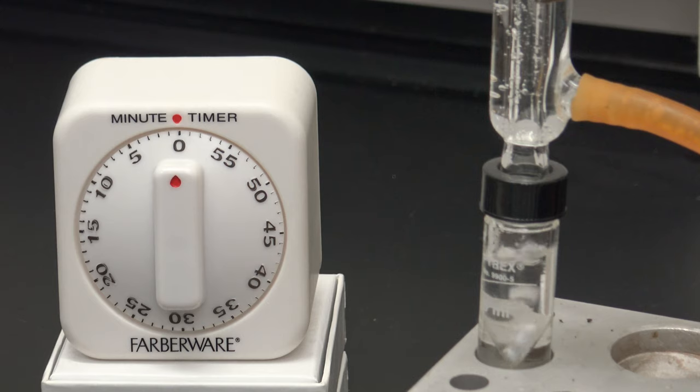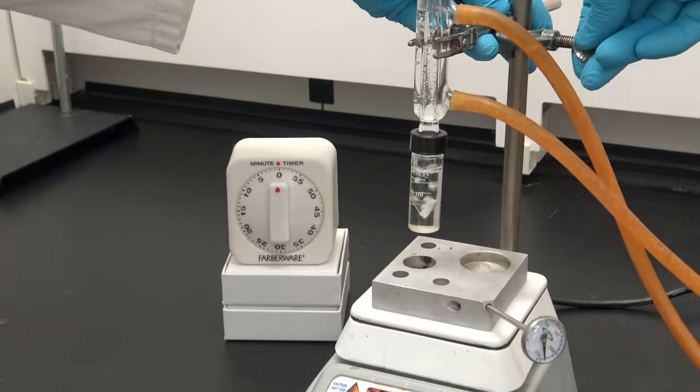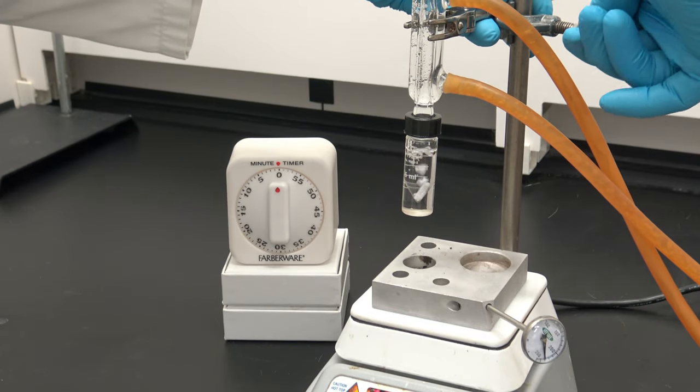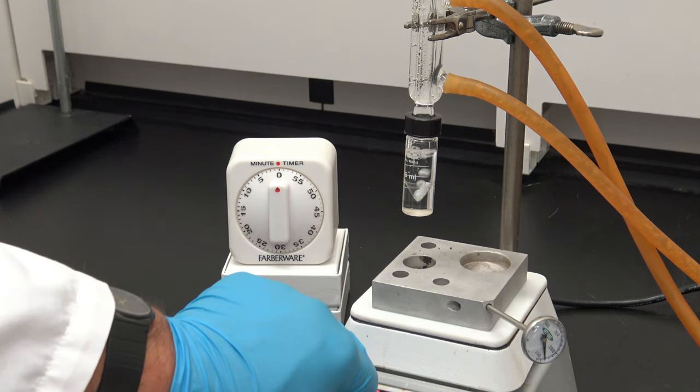Our reaction has now been refluxing for 30 minutes. I'm now going to raise my reaction vessel off the heating block and let it cool to room temperature. And turn off my heat on my hot plate.